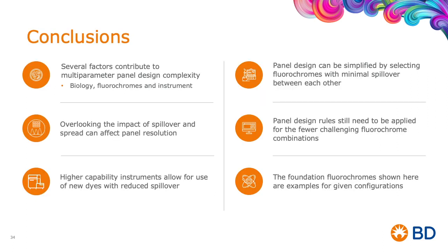So just to conclude the webinar, what we have discussed is that at the high level, we have acknowledged there are several factors that contribute to the complexity of multicolor, multi-parameter panel design. There's the biology, the fluorochromes, the instrument.